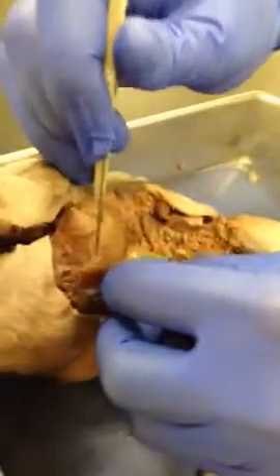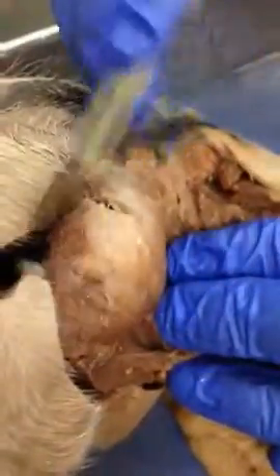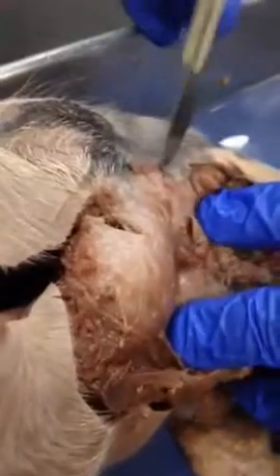You can also see the jawline, and the facial nerve — it's kind of hidden underneath. But the facial nerve runs alongside here and goes up to the brain.